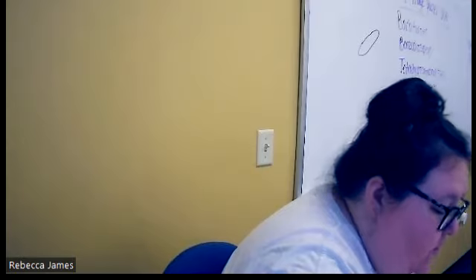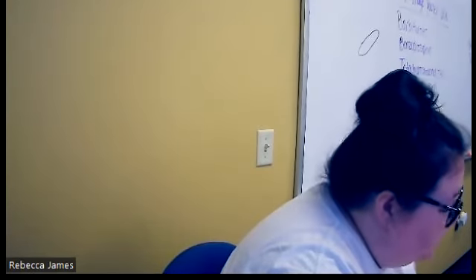Very hard to see. But y'all see it? You've got one at the top, at the bottom, and then on the sides. On the right side, you can barely see it, but it's there. So, Maltese cross.